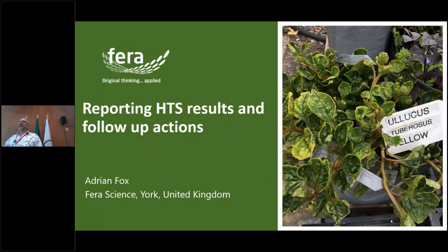There's no point. If it's a potato sample with a mottle, why would you HTS it? It's probably PVY. Let's test it for PVY by ELISA and get it out the door quickly. However, there are things that come in that the conventional diagnostics don't quite make sense. We flip to HTS. There are also things that come in that we have no a priori knowledge of what may be in that plant species.